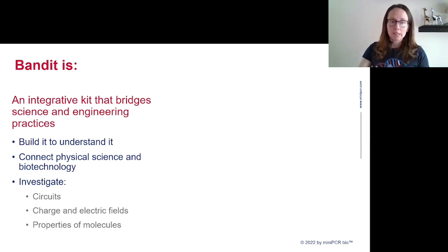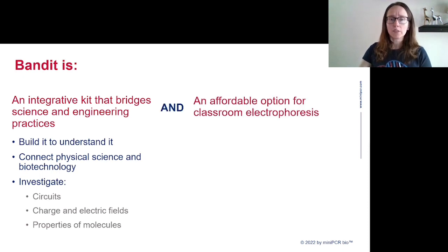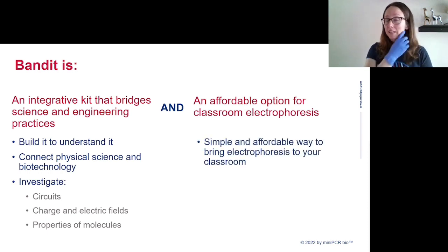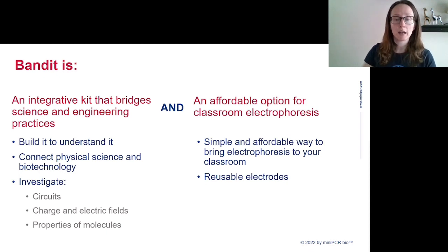Bandit is an integrative kit that bridges science and engineering practices. But I also want to emphasize that it's a fully functional electrophoresis system and an affordable option for classroom electrophoresis. Introductory pricing is seventy-five dollars per unit. So it's a simple and affordable way to bring electrophoresis into your classroom. It is not like a single-use kit. You can use it over and over again. Even the electrodes, that fine wire, can be reused time and time again. It runs on electrical power, not on batteries. So there's no consumables other than your gel-making supplies.